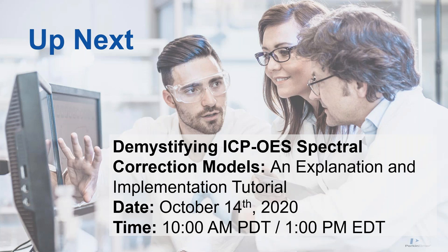This is a good question. I get this question once in a while in different forms: is it better to use a pure standard as the interferent or the unknown sample for that? I'm assuming the question is, should I use a pure standard like you purchase, or the reference, the unknown sample, usually your pure metals or inorganic compounds of some sort, and use that as an interference reference for the MSF model.